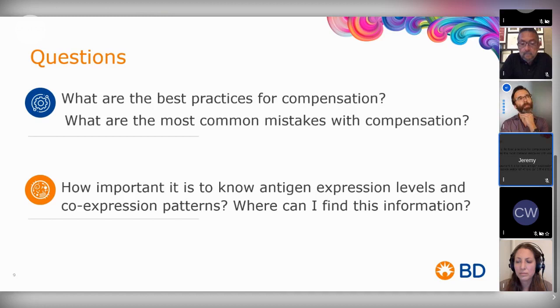So this is a very important aspect, because, again, thinking that you can tweak things at the end also deters you from applying the best practices in the first place, right? And again, if you see something wrong with compensation, it's because you didn't apply the proper compensation controls. So I think those would be the most common problems in compensation.